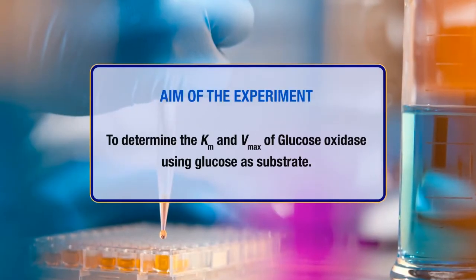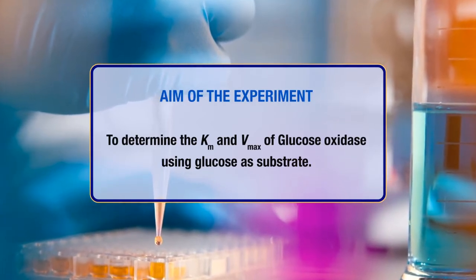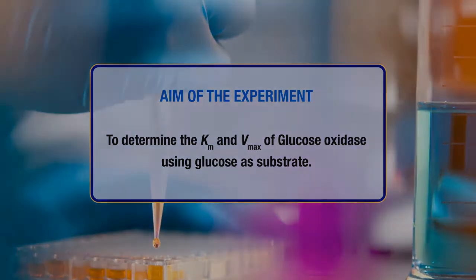Hello students, today we will be learning about enzyme activity assay. Aim of the experiment: to determine the Km and Vmax of glucose oxidase using glucose as substrate.